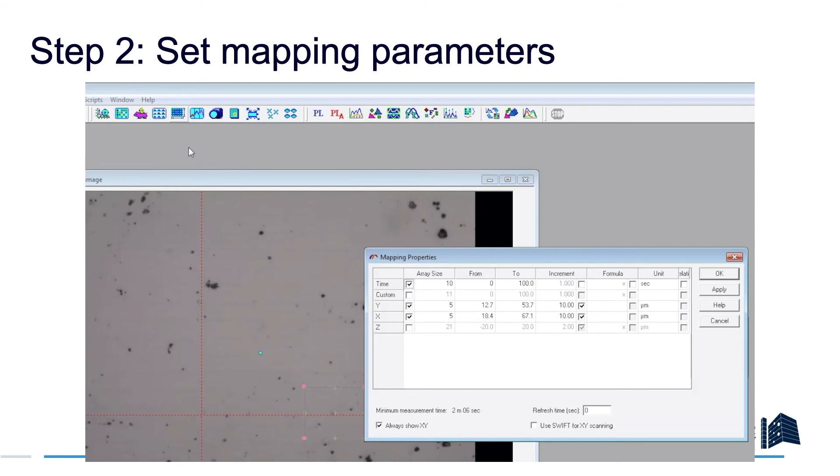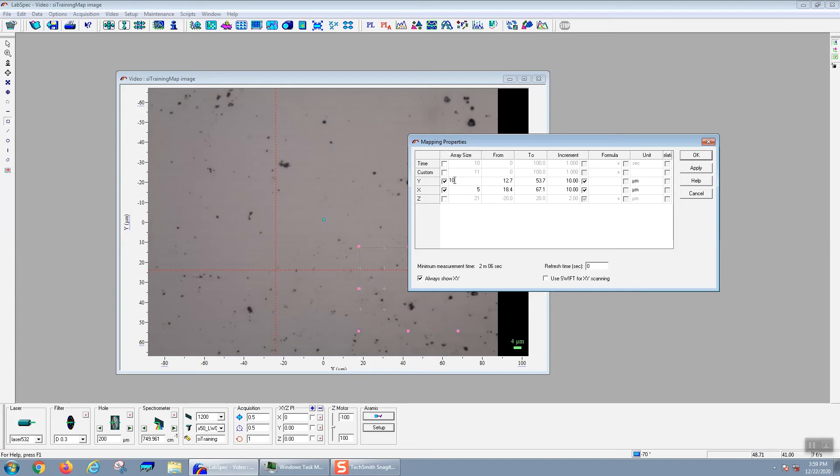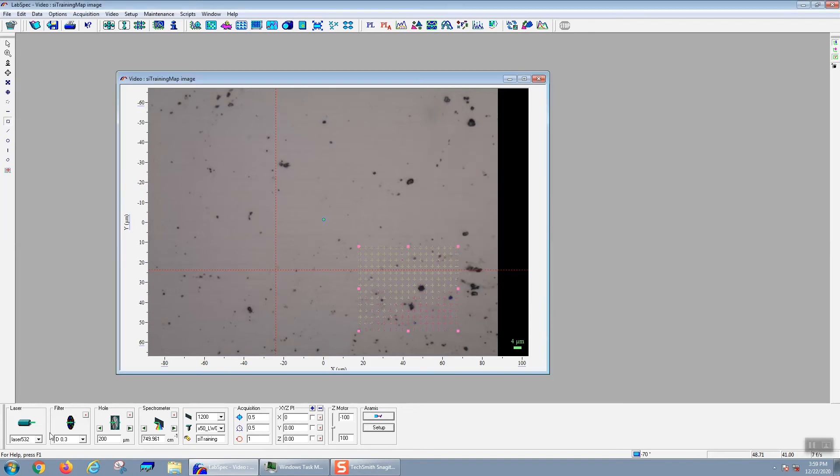First you need to set up which variables you want to map. You're going to uncheck all the boxes except for X and Y if you want to take a two-dimensional map. If you want to take a focal series, you would only check Z. In this case, we're going to take a 2D map. I can set the array size to 10 by 10, or I can set the increment. Here I'll set the increment to 3 microns instead of 10 microns. You'll note that when I change the increment, it changes the array size, and when I change the array size, it'll change the increment.